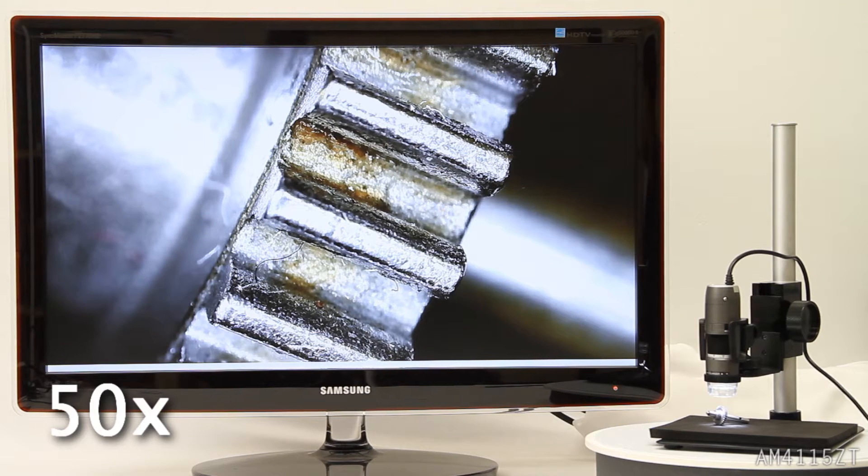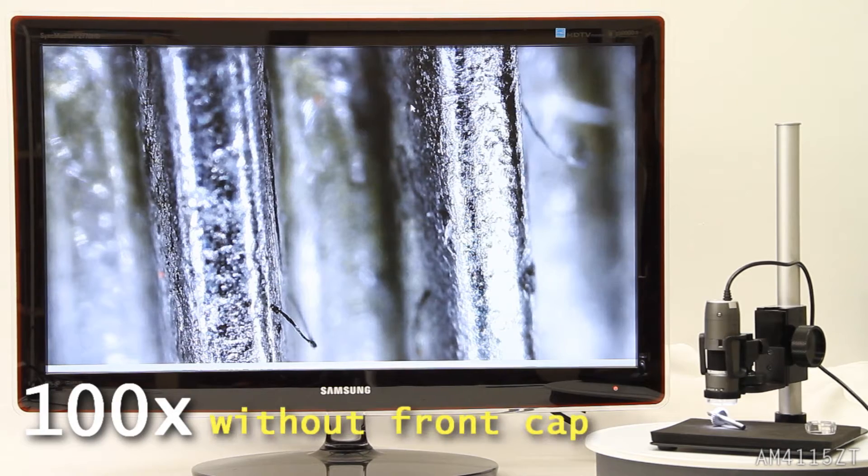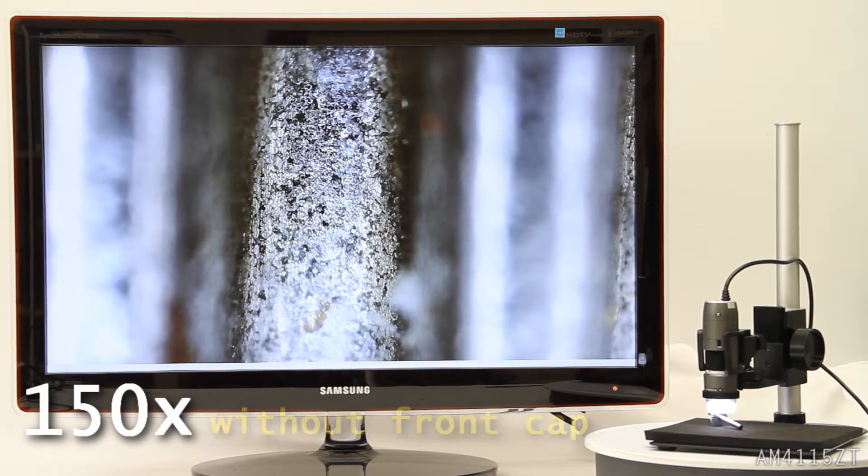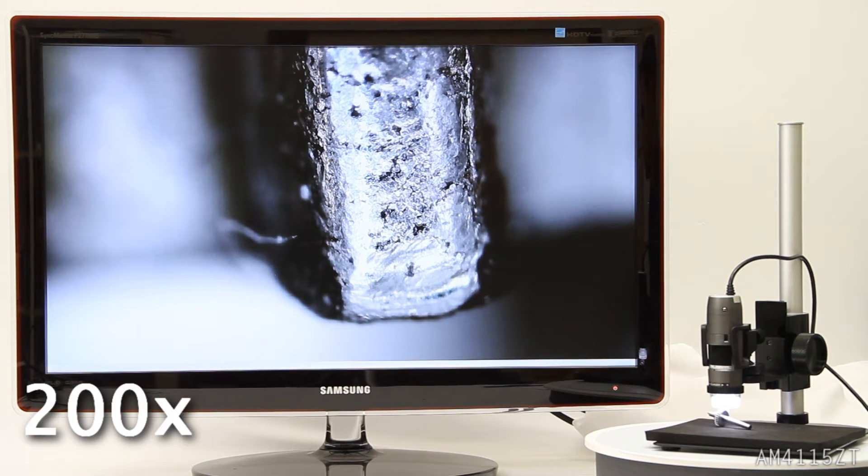The AM4-115ZT has a range of 10 to 230 times magnification. Here are some examples of the working distance and magnification.